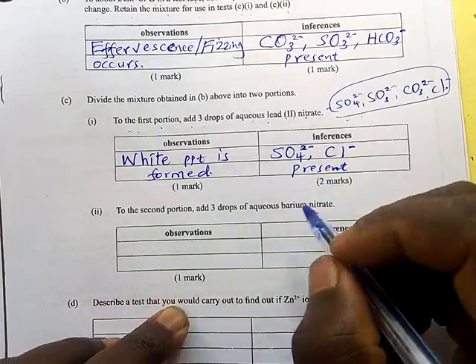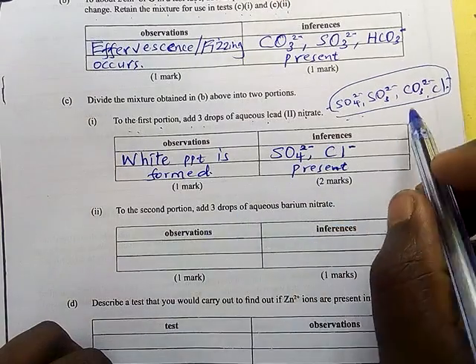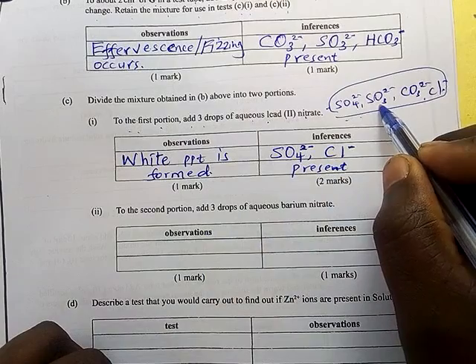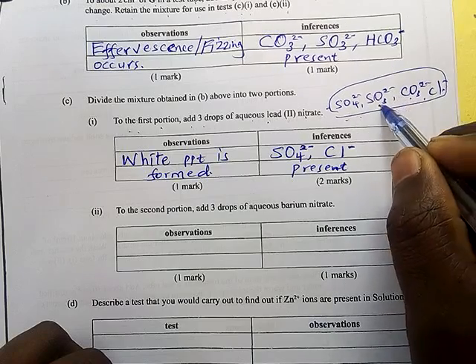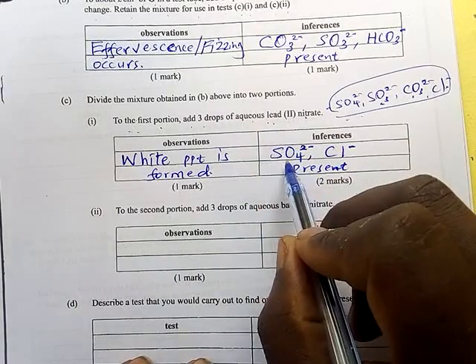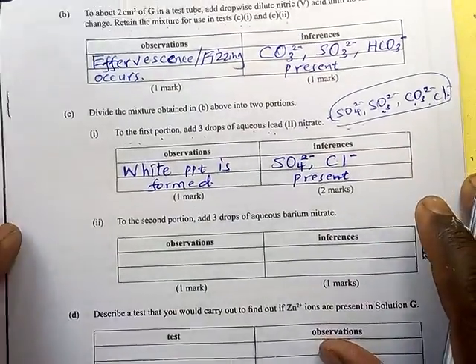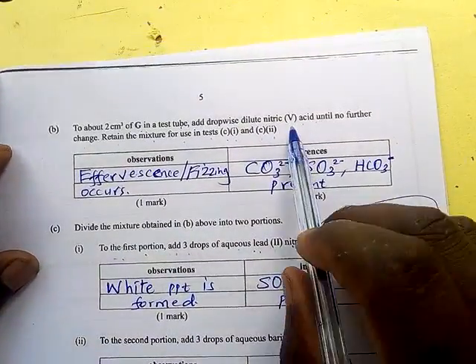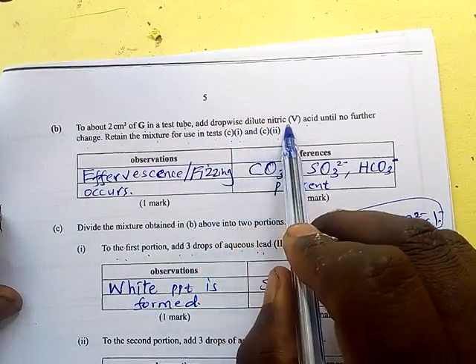Now the question which you may ask, before you ask it, let me answer that. Why didn't I write the sulfite and the carbonate present? Because the carbonate and the sulfite form a white precipitate with lead. Why didn't I include them in this inference? First, you need to know that nitric acid was added dropwise until no further change.